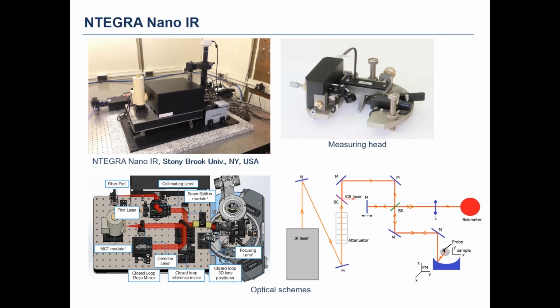Okay, I see that our attendees have some experience with such systems, so very specific but interesting questions. How do you handle the AFM laser with the infrared source for simultaneous imaging? Are there any noises? I think this question is related to cross noises.